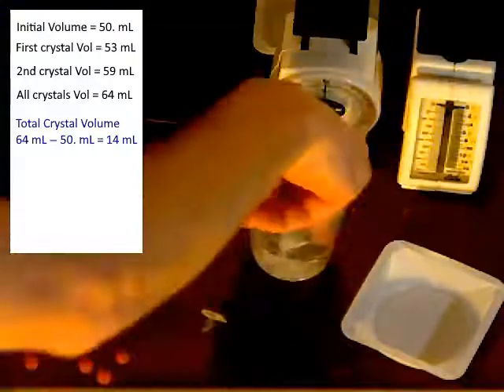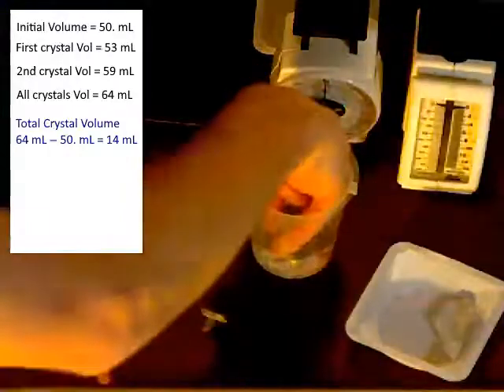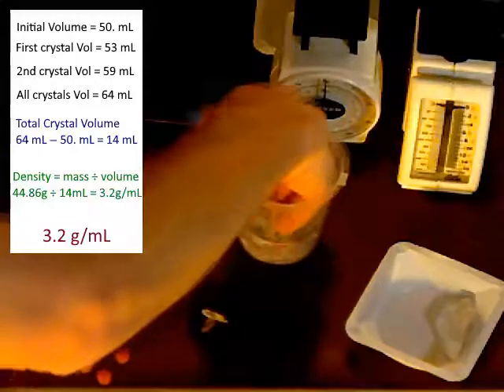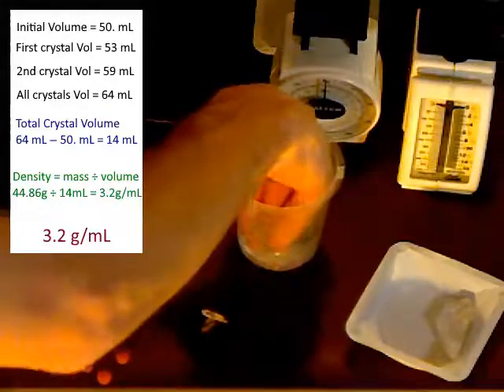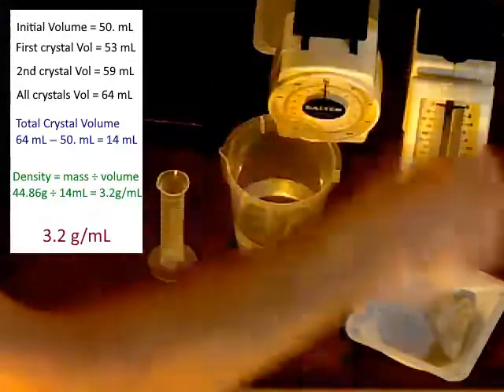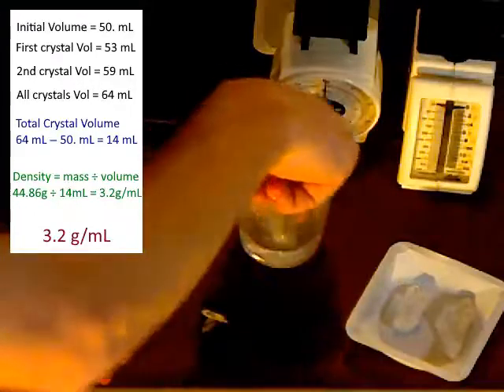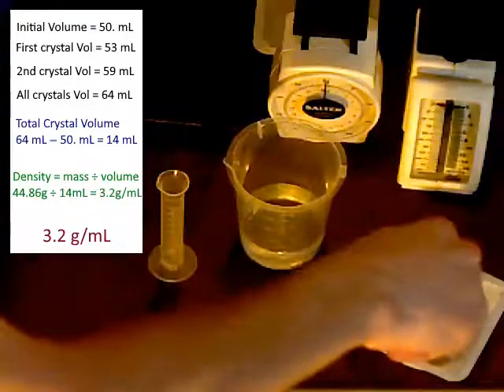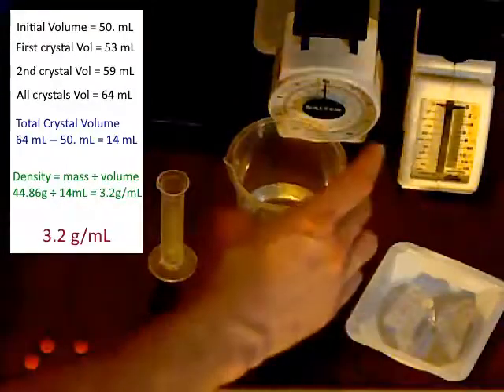Okay, then I can just simply retrieve my crystals and let them dry off to the side. So I can determine what the average density of these larger crystals is, these well-established, relatively pure quartz crystals. And I can compare that with the smaller quartz crystals.